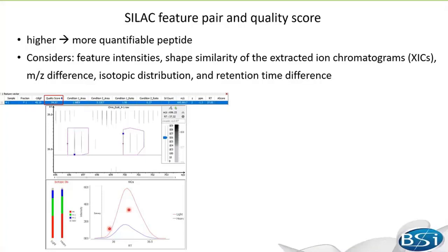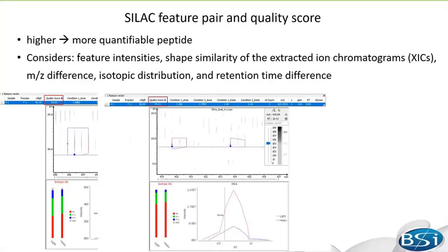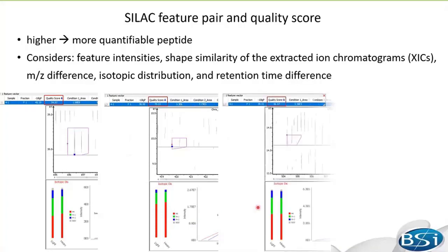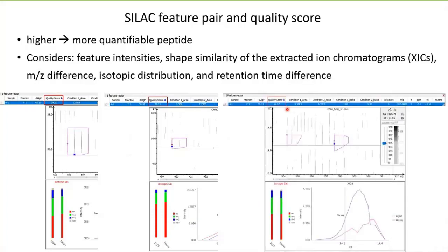The quality score calculation also considers mass difference, isotopic distribution, and retention time difference. The second example has a quality score of 75 — you can see that the intensities are not very high and the XIC shape is not so good. The last one has a quality score of 46, and the XIC looks even worse. You may wonder if there is a quality score threshold you can set to filter out low-quality feature pairs, like the last one, so they are not used for quantification.